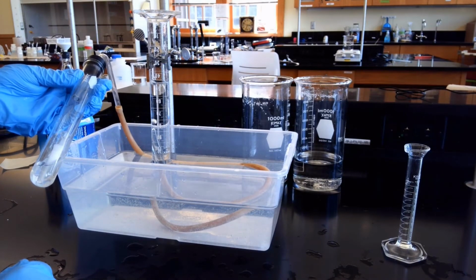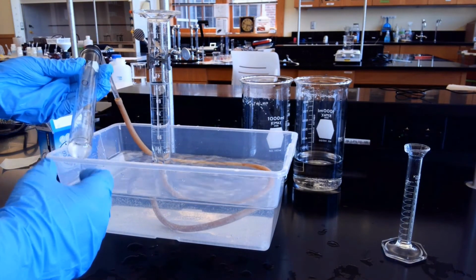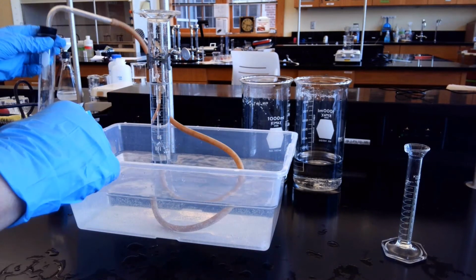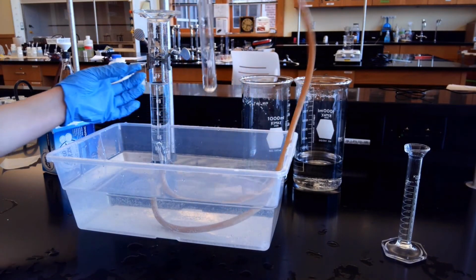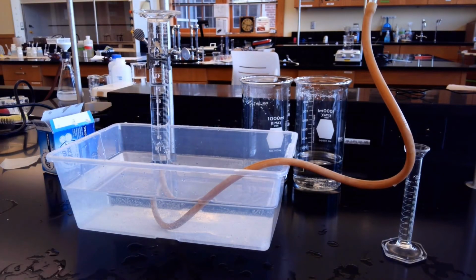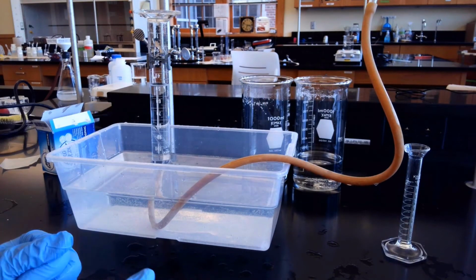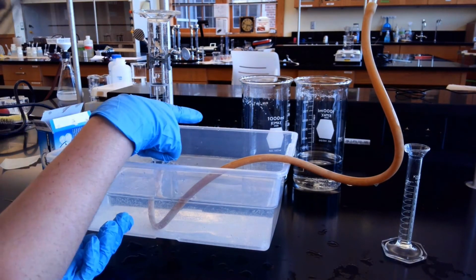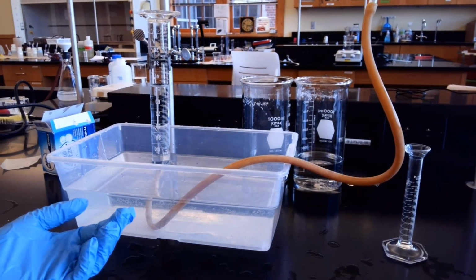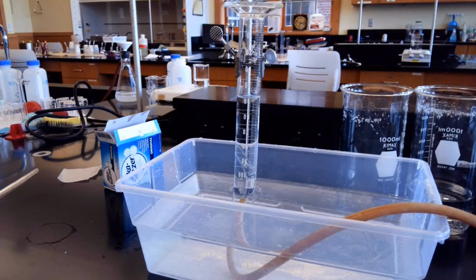There we go. Okay, as you can see, we're all done reacting. Just going to pass this through this way, pop it up over here. And we're going to make sure all of our gas is pushed through, which looks like it has. So now we're going to get our new volume. If we're looking over here, maybe I can bring you guys closer again. Oops. Sorry for the shake.